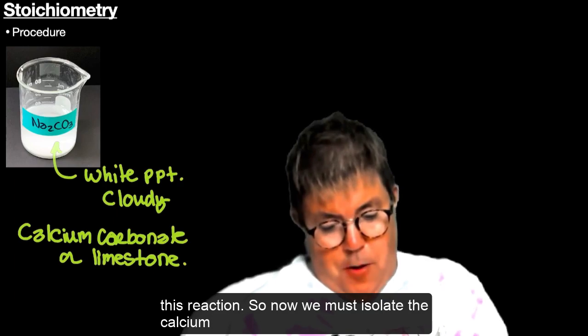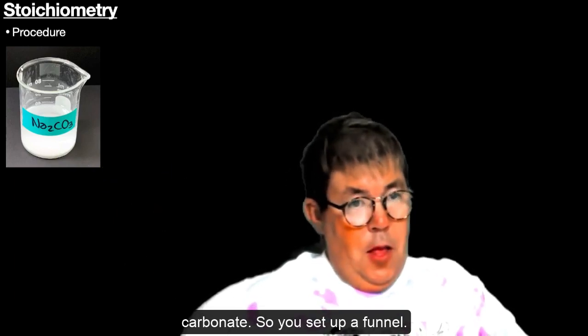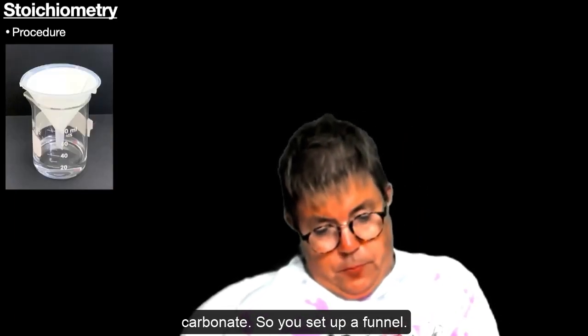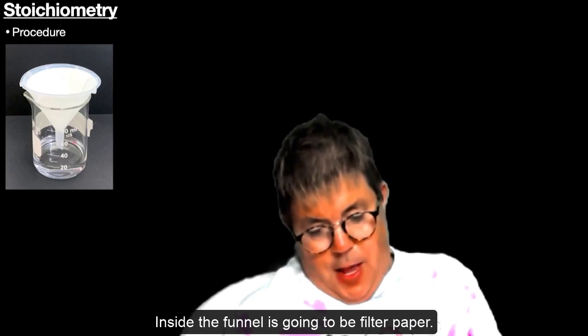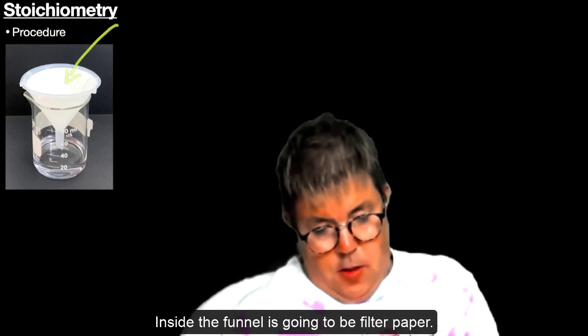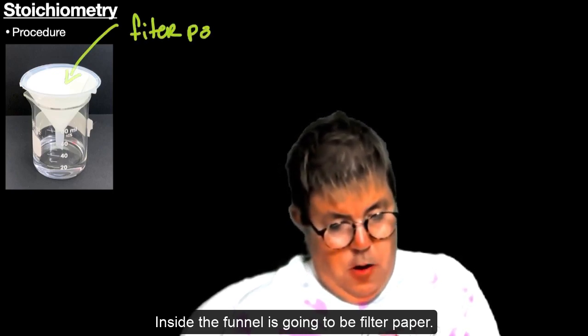Now we must isolate the calcium carbonate. So you set up a funnel. Inside the funnel is going to be filter paper.